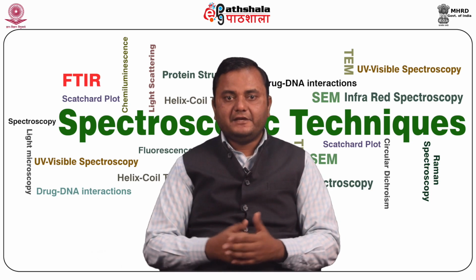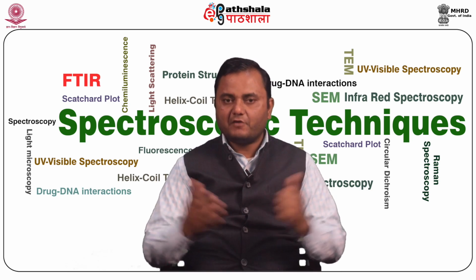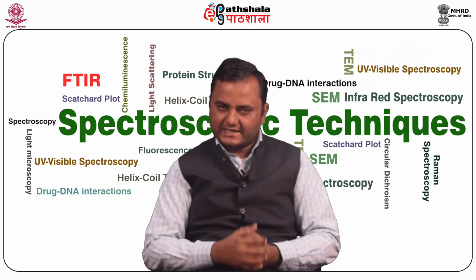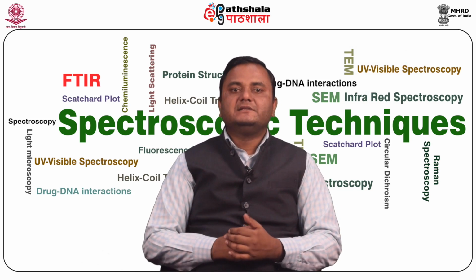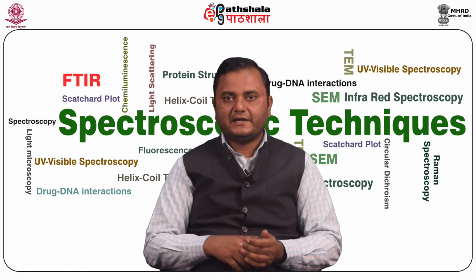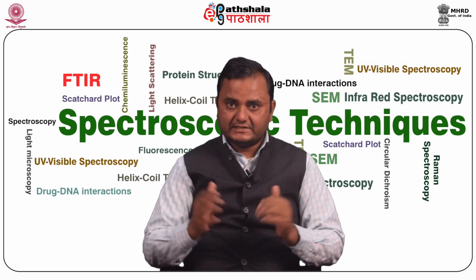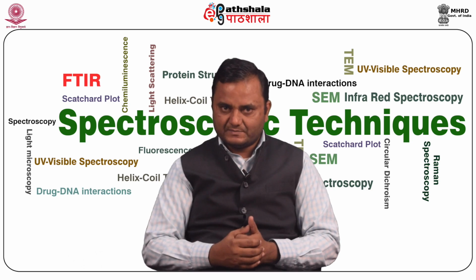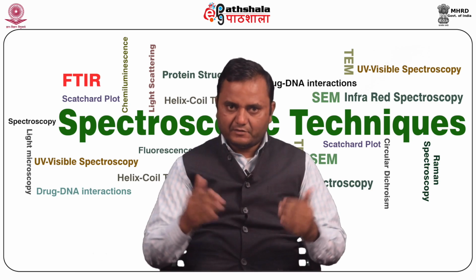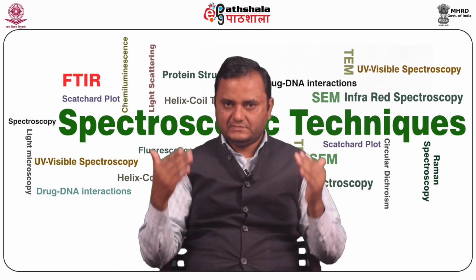Theoretically, an infinitely long scan would average out all the noise of the baseline. However, it is not possible, but it can be theoretically done. That's why we focus on increasing the number of scans as much as we can. The dispersive instrument collects data one wavelength at a time and collects only a single spectrum, and there is no good method for increasing the signal to noise ratio in the dispersive spectrum. However, the FTIR coupled with an interferometer gives us very high data quality with an improved signal to noise ratio.